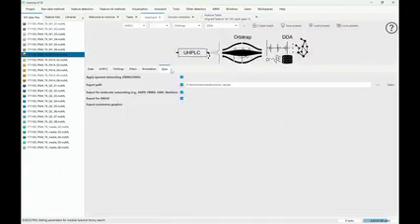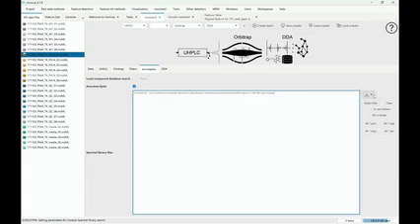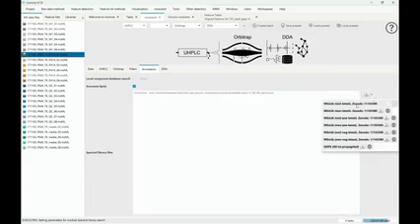Yes. So for the annotation, in this annotation tab, so far there's a local compound database search, where you can have your own retention time and mass-to-charge ratio pairs, or maybe CCS values for ion mobility. There are also options to say I have this compound structure and it should have these different adducts, and then we can search for it. Lipids are annotated by rule-based annotation, and with the spectral library you can go to this download button, and you can see that the MSNlib from Corinna and colleagues is basically here.